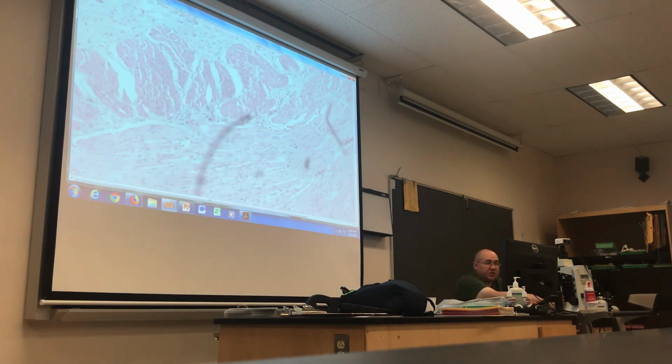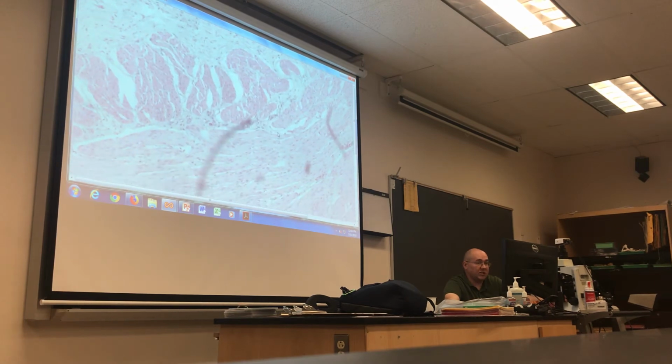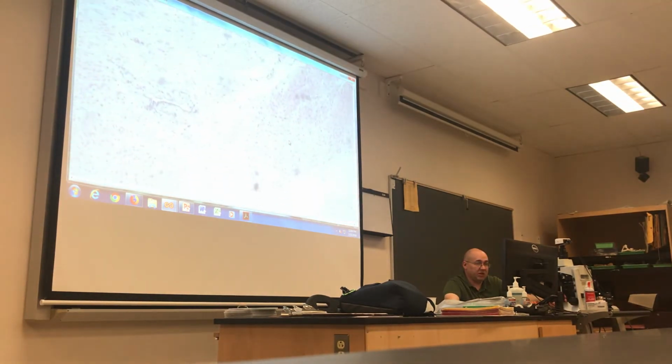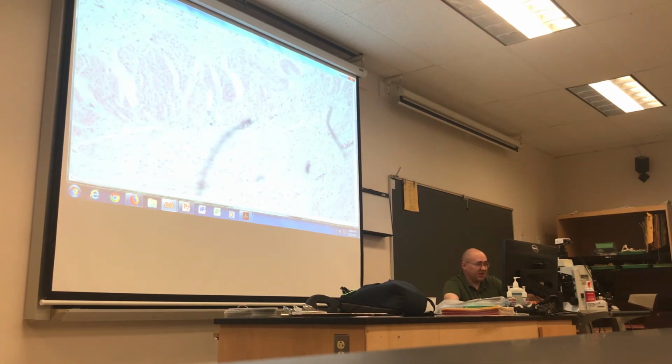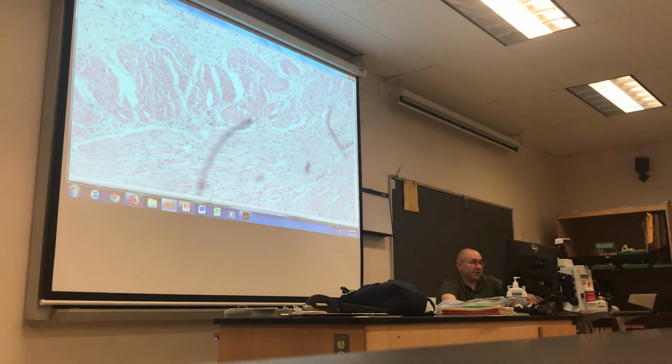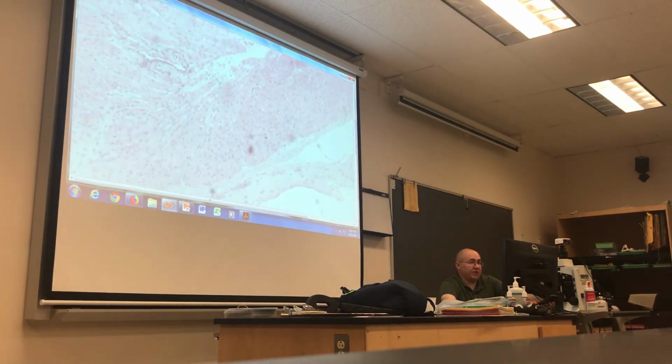Then you'll notice we transition to one of our more well-known tissues hanging out down through here. And you actually have 3 layers of it that create an overall structure. What is that within the bladder? What's the muscular layer within the bladder? It's actually 3 layers. The detrusor muscle, right, hanging out in there. So you see one layer here, one layer here, and then the other layer down here, right? So you see at least 3 layers hanging out through here. So that's going to be all the detrusor muscle.